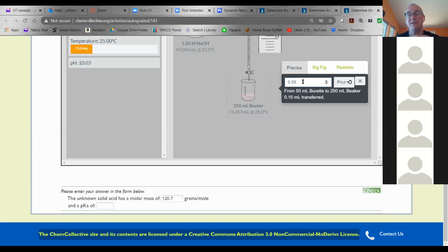Just like here, you notice I made a mistake when I calculated my molar mass. I was off by 10 times. So when I did my experiment the next time, I would realize that if I have 2 answers that are 121 and the other one is 1201, it's pretty obvious which one is wrong. That's the advantage of doing everything in triplicate. Most scientists do all their experiments in triplicate, because if you do it twice and you get 2 different answers, you don't know which one is wrong. But if you do it 3 times and 2 answers are the same and the other one's different, then you know that's the one to get rid of and repeat. Okay?